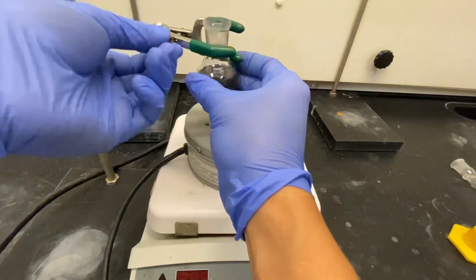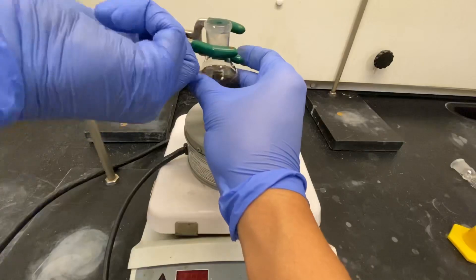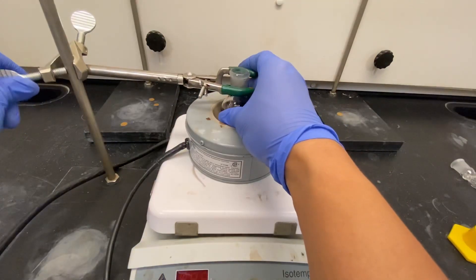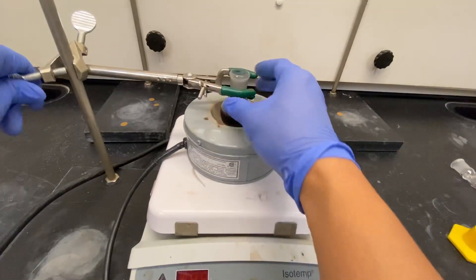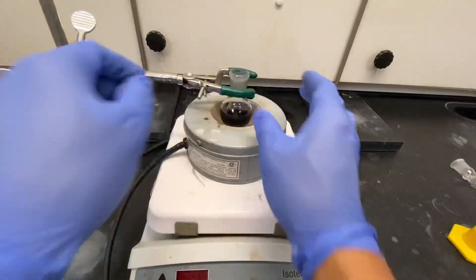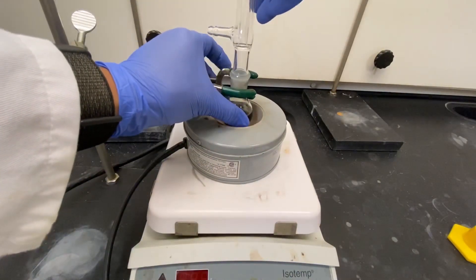Set up the reflux apparatus. Place the flask inside the well of the heating mantle without touching the surface of the mantle. Place the condenser and turn on the cooling water.